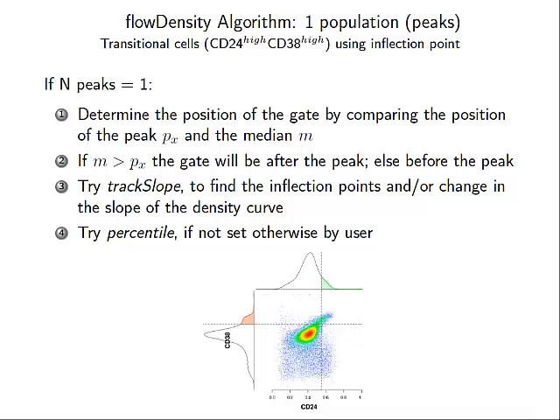But I guess my point is that I don't feel that that's a population or should be gated at all. Then, if you don't have to gate it, this is where you have the gating hierarchy, right? If you don't care about this and you're using flow density, you do care, but it's not a population. I think it's important that there's a gradient there, compared to the FMO underneath the gate, that something's happening, right? Okay. But it's not necessarily a population; it's just an increase in expression. I think I'm just arguing about the definition of population. I alluded to that, right?